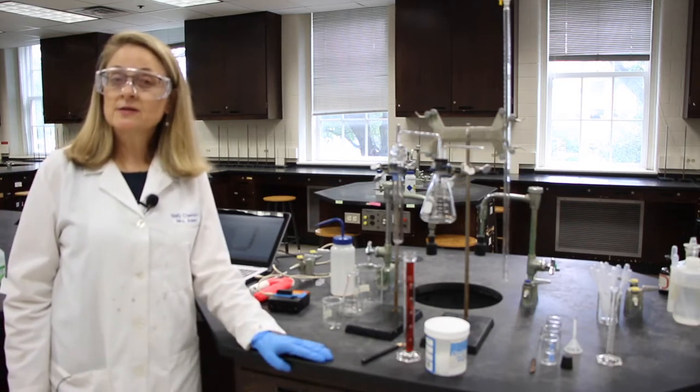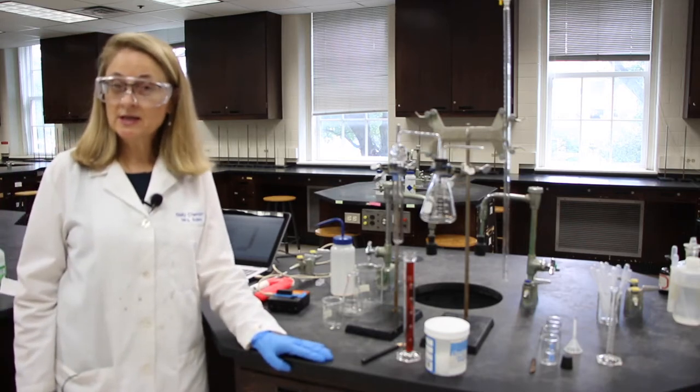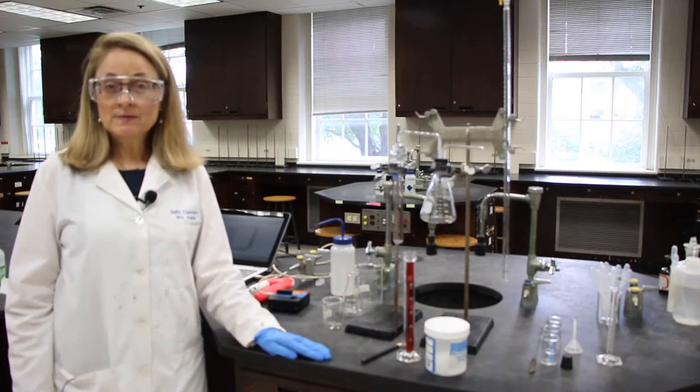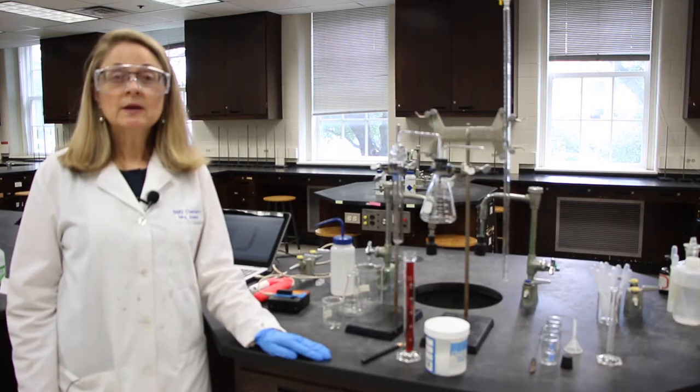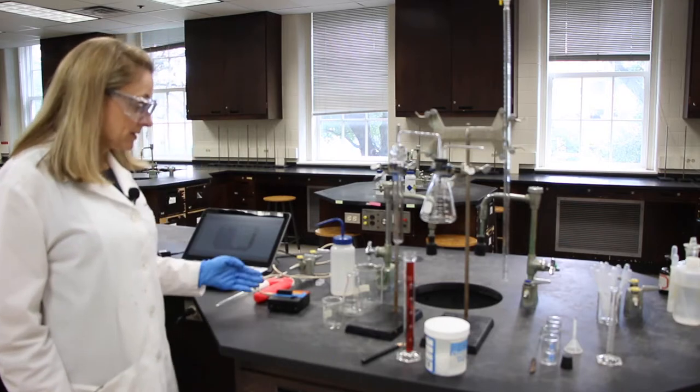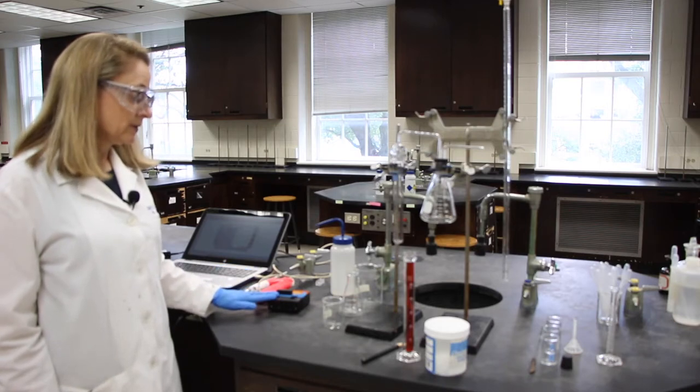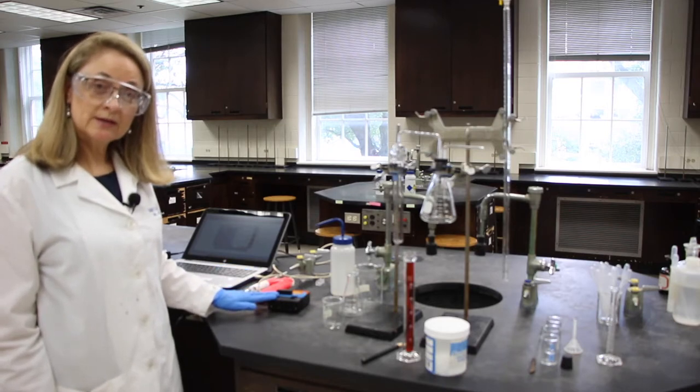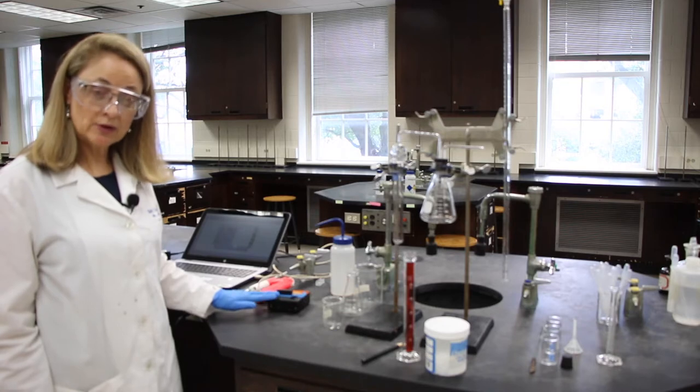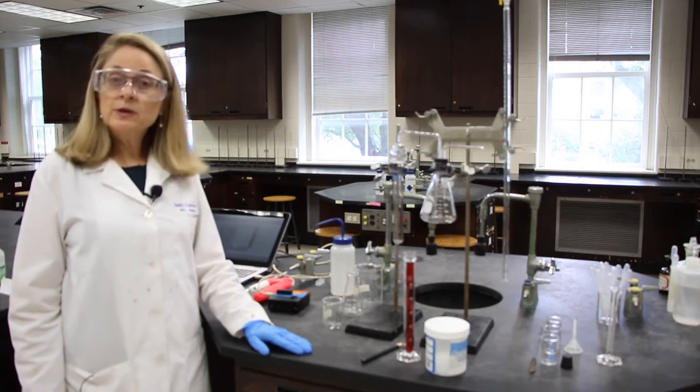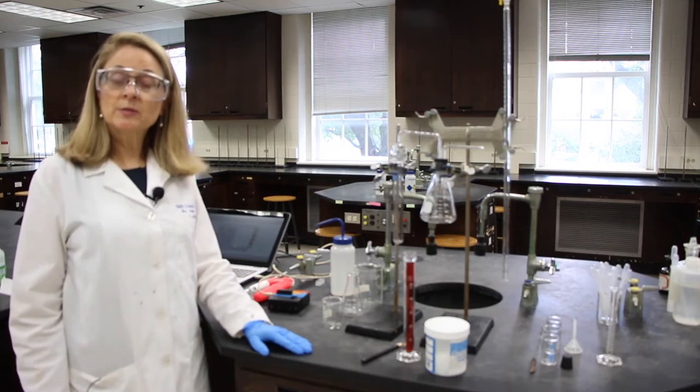This experiment has a lot of semester one techniques in it and we'll just be reviewing those. And we'll also be introducing a new piece of equipment, the spectrometer. And this will be to determine our percent copper in solution. We'll measure the absorbance. It's a highly colored solution. And we'll be using titration to determine the percent silver.